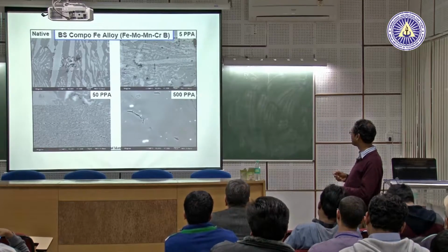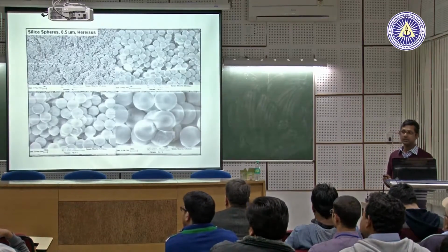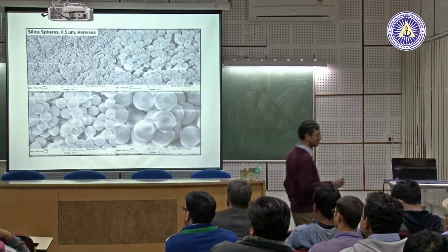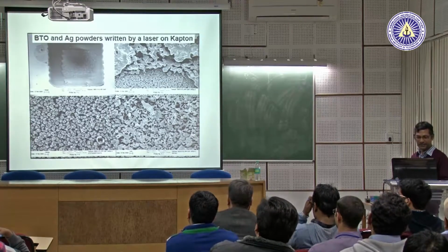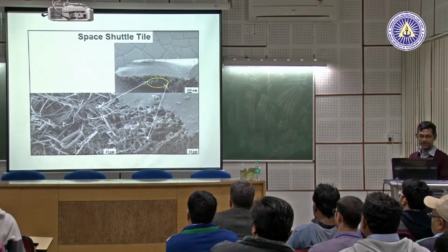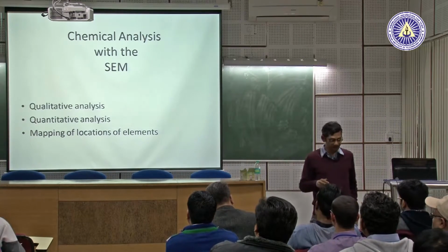I don't know what PPA is. It's some polymer, carbon related stuff which has been coated on the surface. So in the previous image, we have these white areas. These are again because of charging only, not fully gone. And same thing here also, magnified to different levels. These are all from different pictures. So I have just briefly given you an idea.